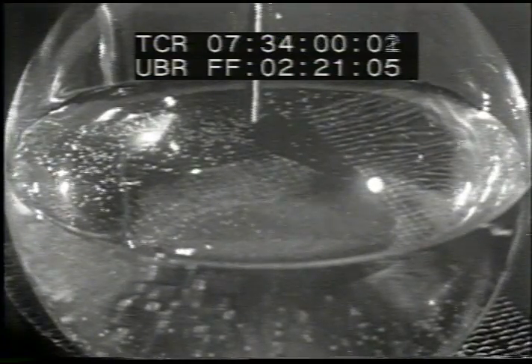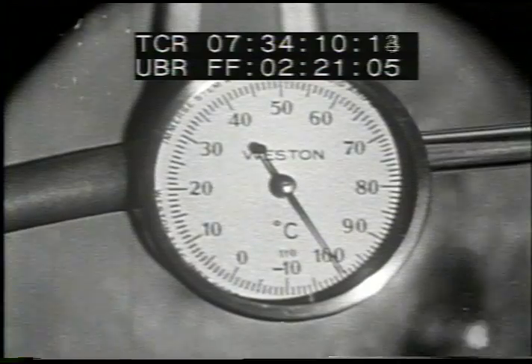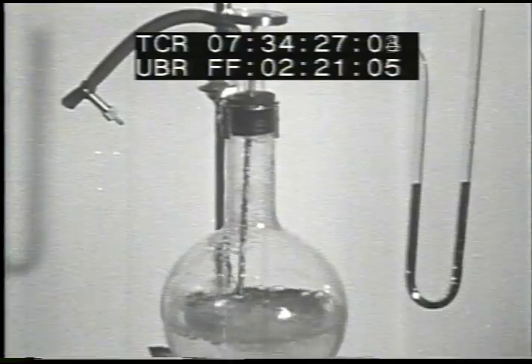Soon, bubbles of steam form on the bottom of the flask. Eventually, as the water is heated, the bubbles reach the surface of the liquid, and the water is said to boil. The temperature now becomes constant. Notice that the steam in the flask is invisible to the eye. However, as it leaves the outlet, it forms a cloud or mist. This cloud, commonly but mistakenly known as steam, is actually water which has been condensed by the cool air.